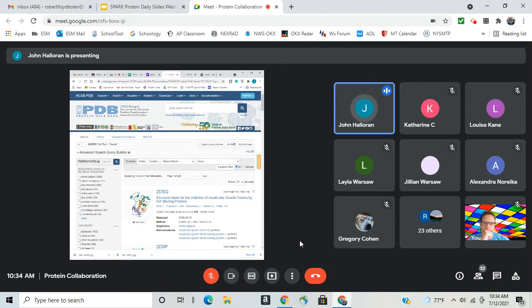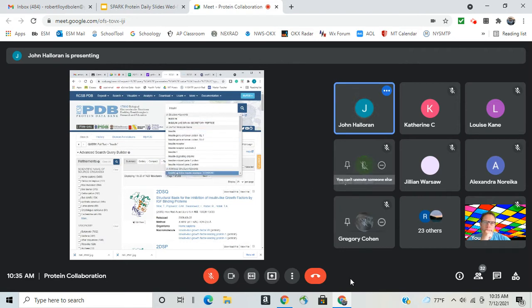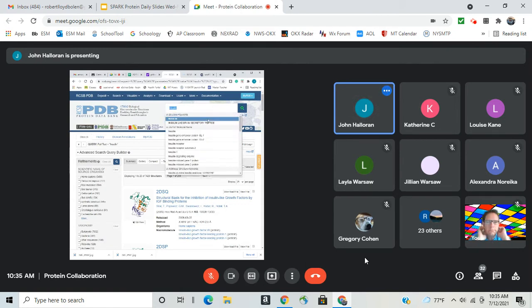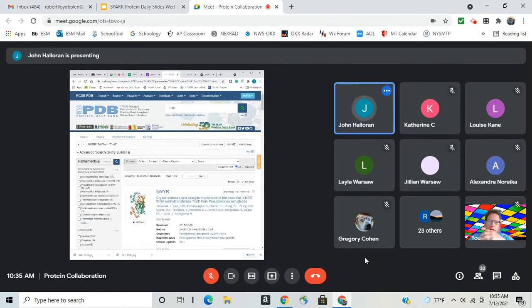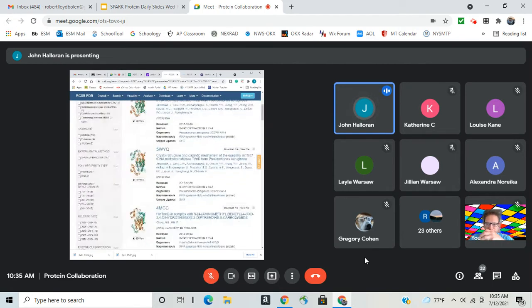So in that case, that's when you're going to start looking at more options, like is it in the keyword, is it in the name. There's also an option where you can do something like a Google advanced search. But for today, I'm going to keep it simple and walk through some basic options. So when you type in a keyword and you get your list of structures back, over here there are going to be ways to refine that search.